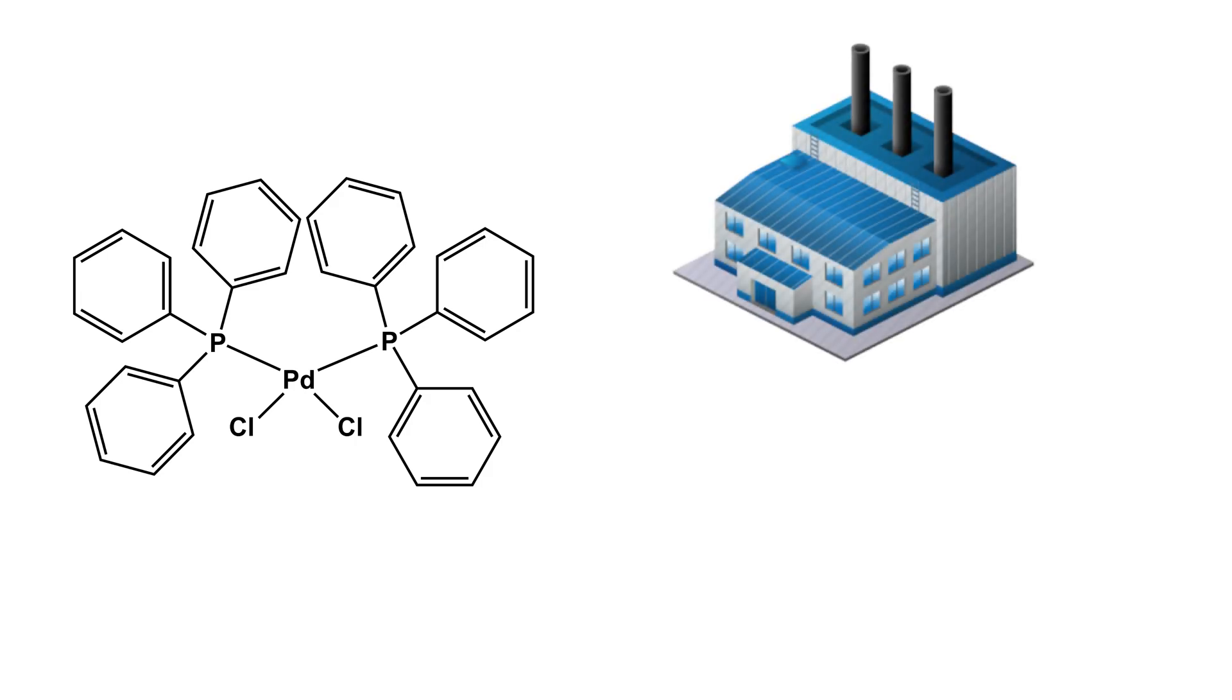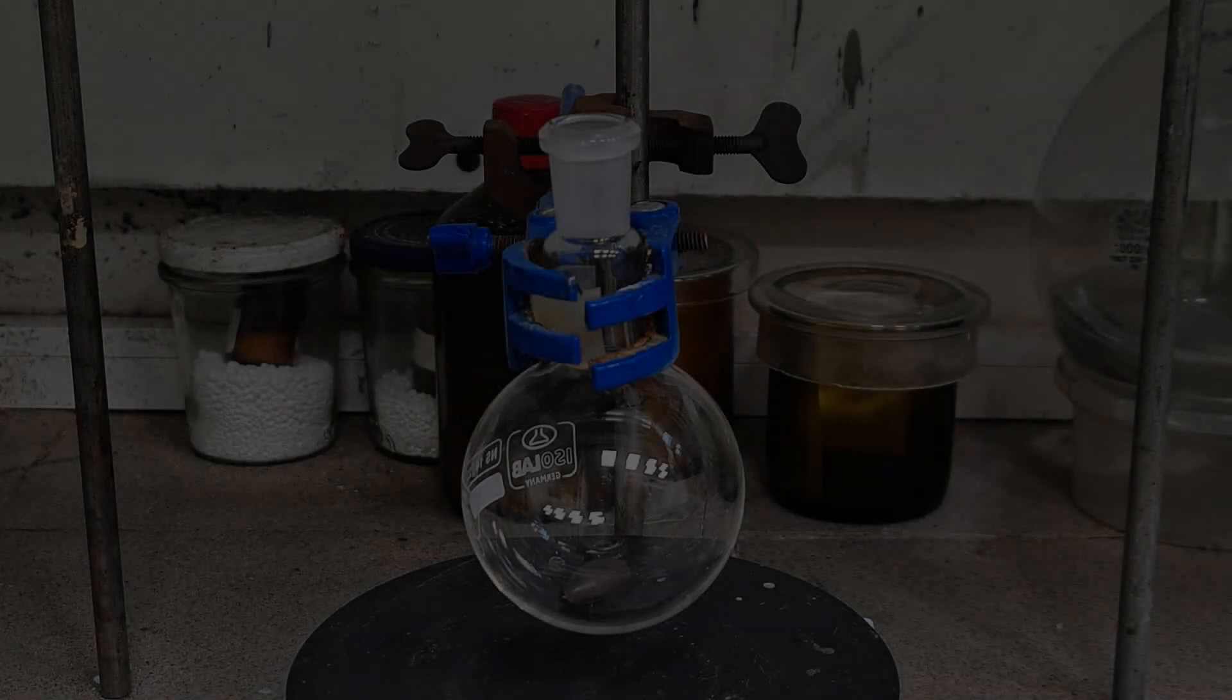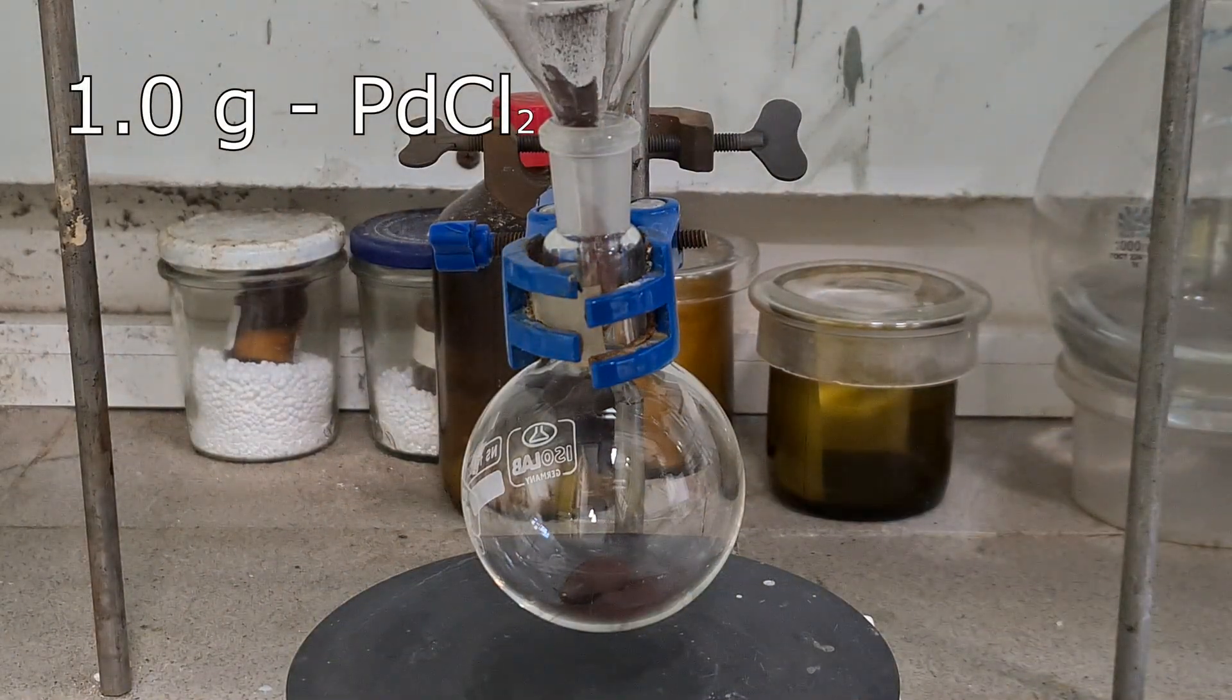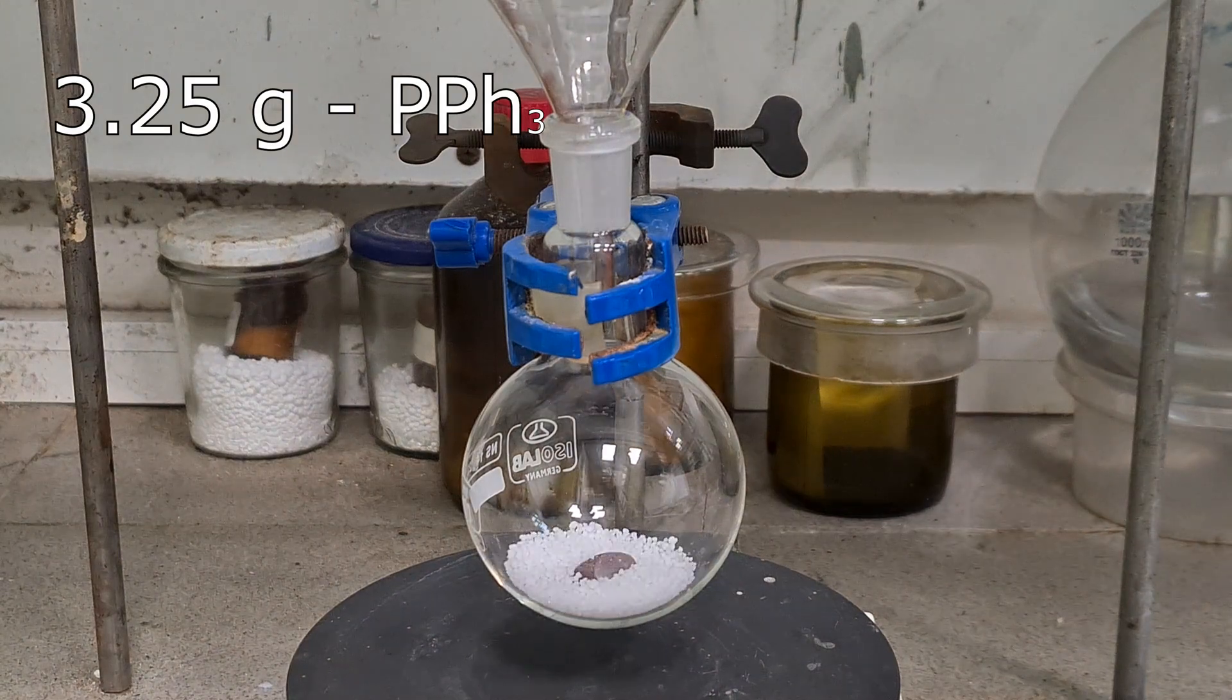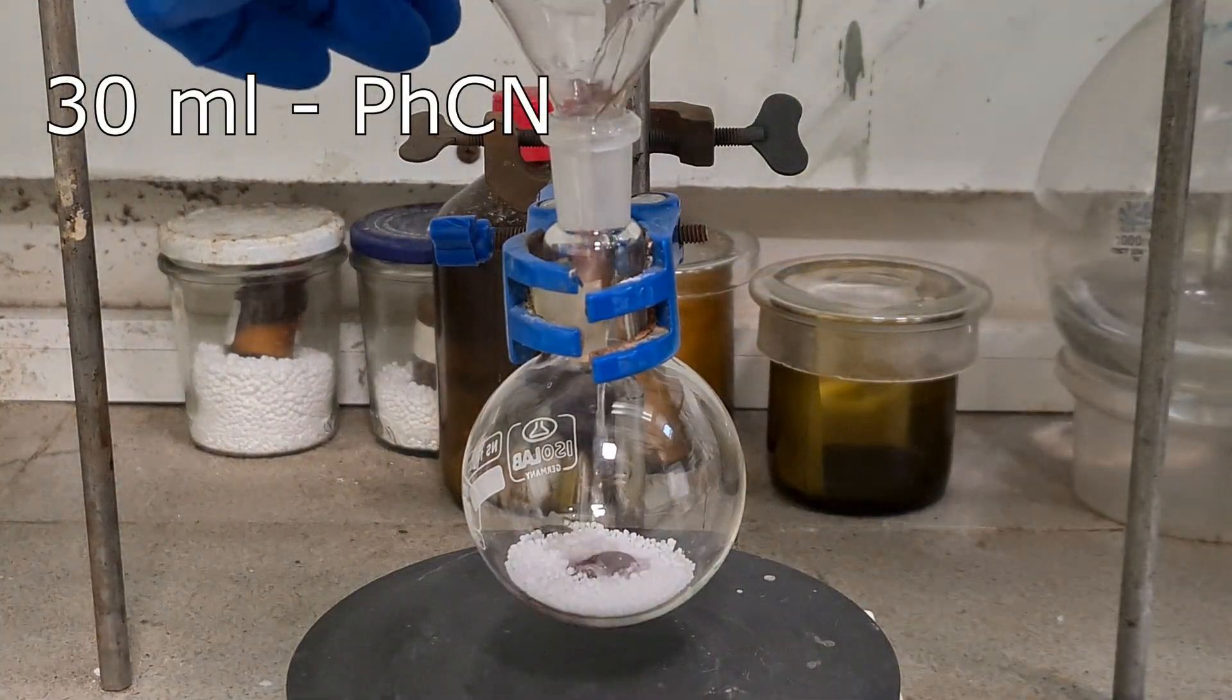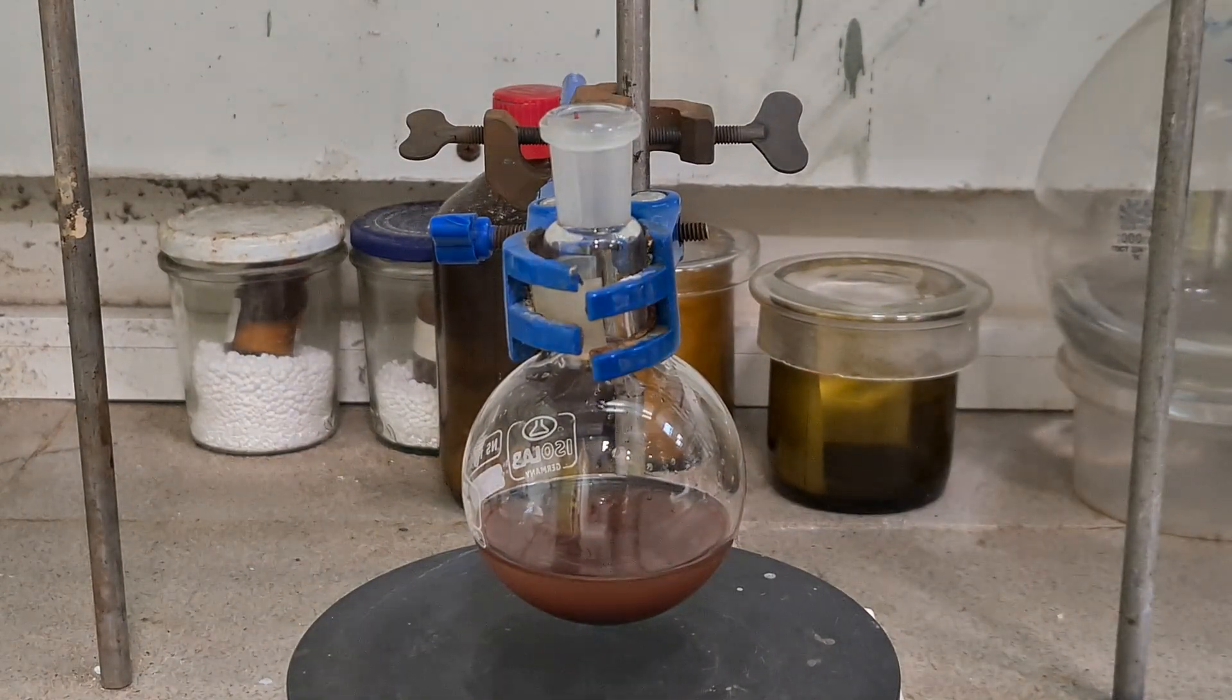Also it's a pretty common catalyst for unsymmetrical Sonogashira reaction. OK, let's get started. First, put 1 gram of palladium dichloride in a round bottom flask with a stir bar. Then, put 3.25 grams of triphenylphosphine and pour 30 ml of benzonitrile to it. Acetonitrile could be used for sure, but it results in lesser yield.